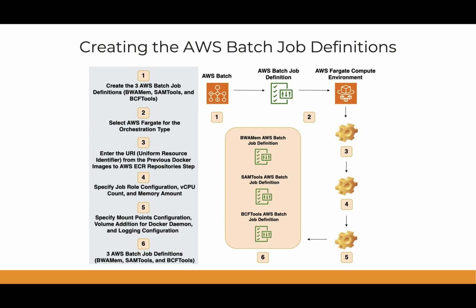We create AWS batch job definitions for BWAMem, SAMTools, and BCFTools. This step involves the selection of the orchestration type, job role, configuration, vCPU count, memory amount, and Docker daemon volume addition.